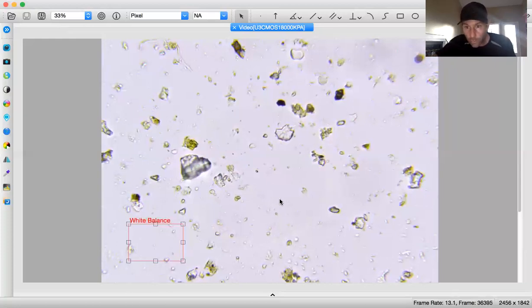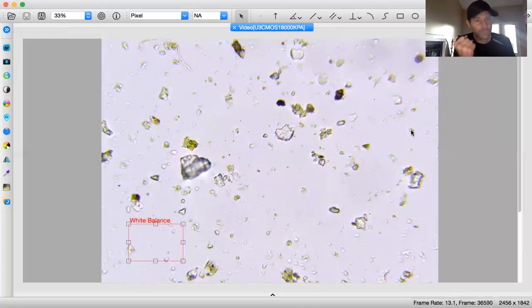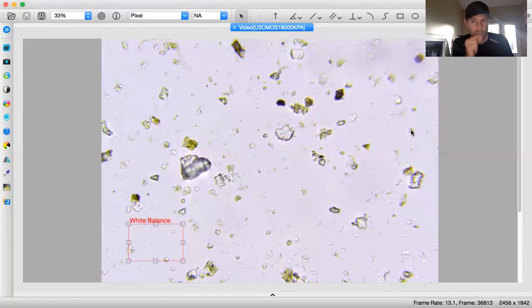Oh, whoa! What's that? I didn't see cilia. That looked like a flagellate, but I didn't see the flagella clearly. Dude, you guys, you feel this, right? You feel that frustration. He was so quick, but I saw him clearly. And if I went back in the footage, I bet I could tell. But based on what I'm seeing here, I'm gonna go with a flagellate. It was slow motion. It was smooth, so it could have been a ciliate. But we've seen smooth before on the bottom down here, and I really think that was a flagellate.